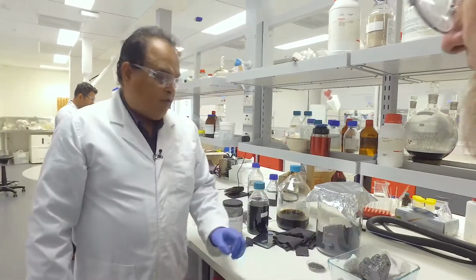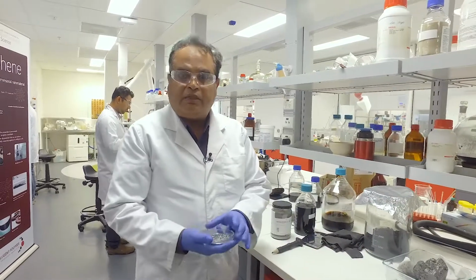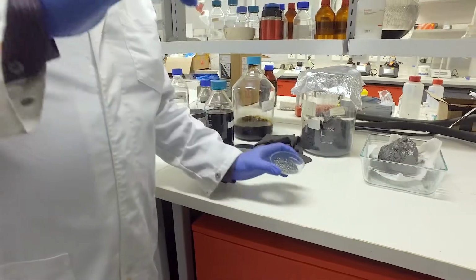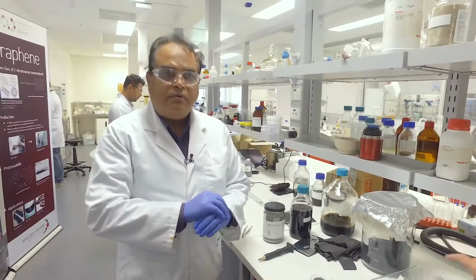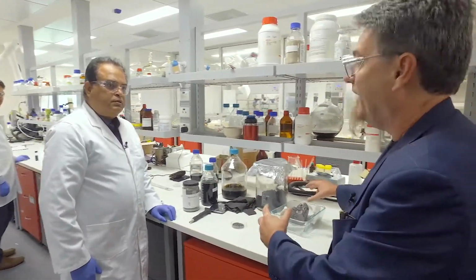99% pure. So what we are doing is we are starting with this graphite and making the flakes of this material like this one. And after making the flakes, we are intercalating this material. Between the pi stacking, we put the intercalants. And so then, just going back to taking the graphite, yeah. So we take the lumps of graphite from a mine.